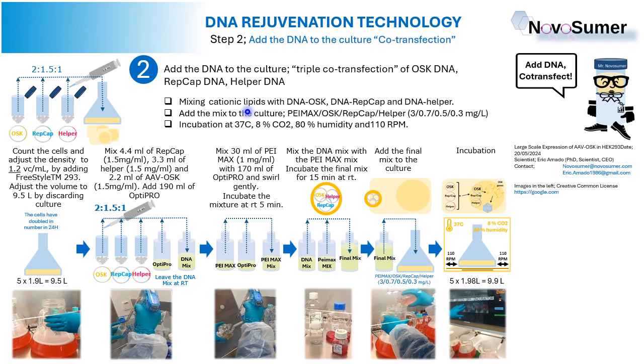So that is the principle behind the inclusion of the DNA inside the mammalian cells. The mammalian cells need to absorb the DNA by using detergent. We call it cationic lipids. It is just detergent. So the first step, very well summarized, is mixing the cationic detergent, the positive detergent, with the DNA that is negatively charged. And after mixing the DNA with the detergent, the only thing we have to do is add the mixture to the culture. Easy, right?